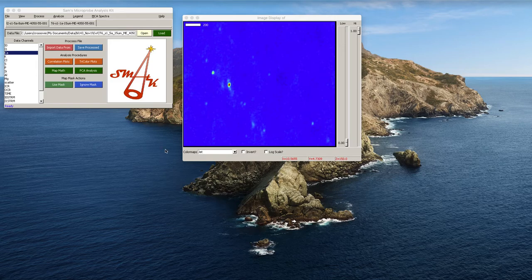In addition to these two data processing steps, it may sometimes be necessary to normalize the data channel by either the time channel or by the ion chamber upstream of the sample. Note that these steps should be taken before you do any blurring. So when do you want to do this? Well, if you see periodic vertical striping in your image, you likely need to normalize your data by the time channel, which provides a record of when the detector data was recorded.